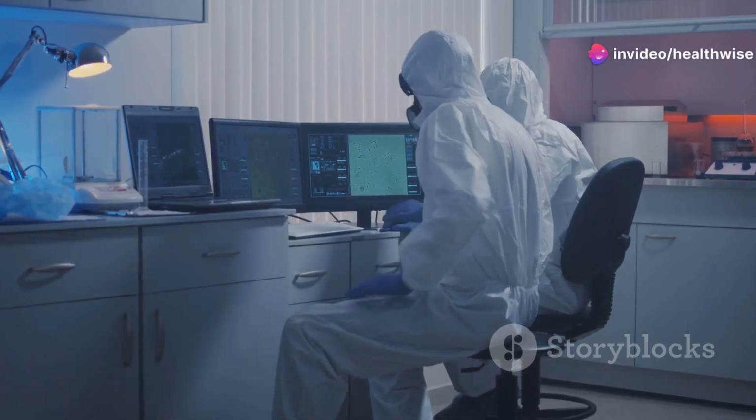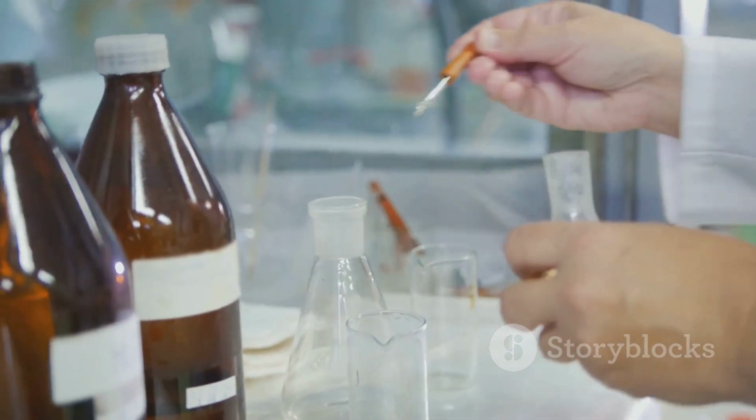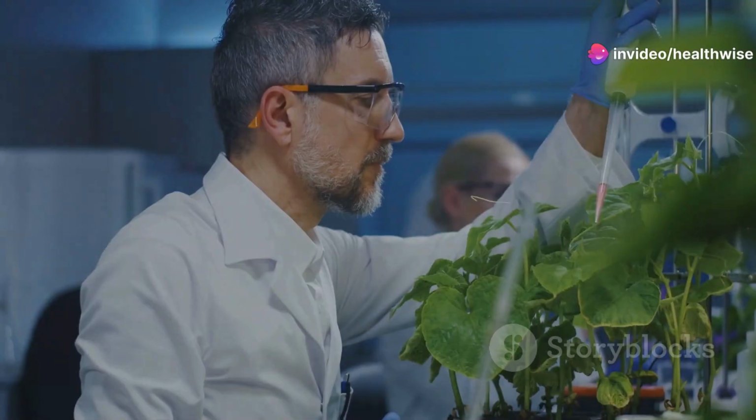Incubators help eliminate these variables by providing a stable environment. Understanding how incubators work is essential for anyone involved in scientific research. This essay will delve into the science behind these devices, their types, uses, and maintenance.